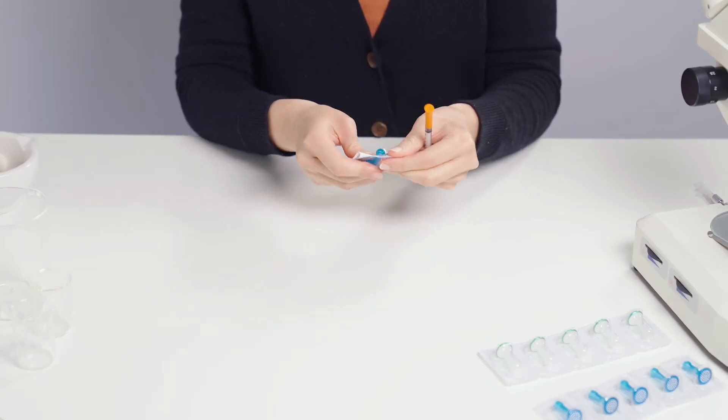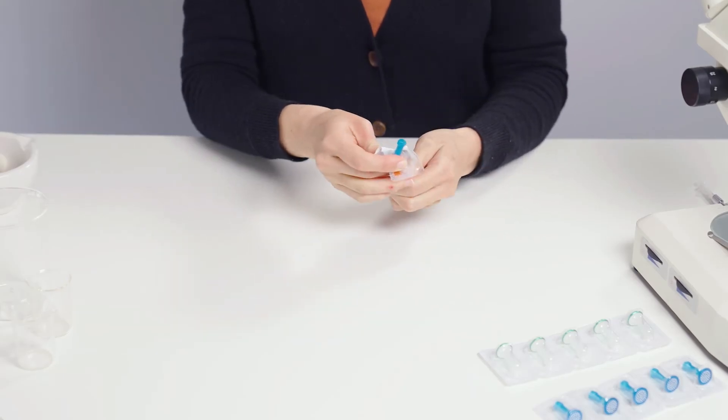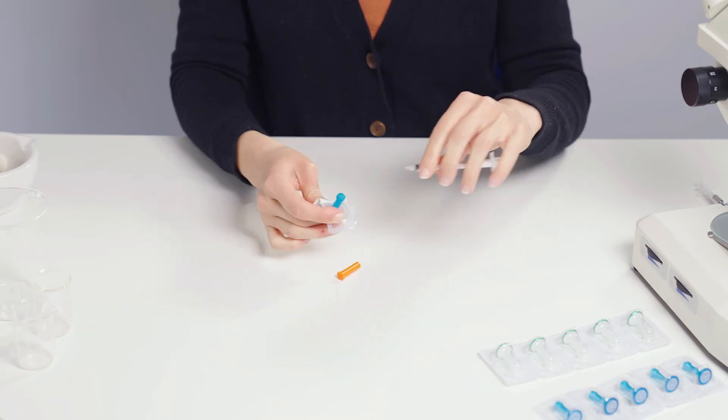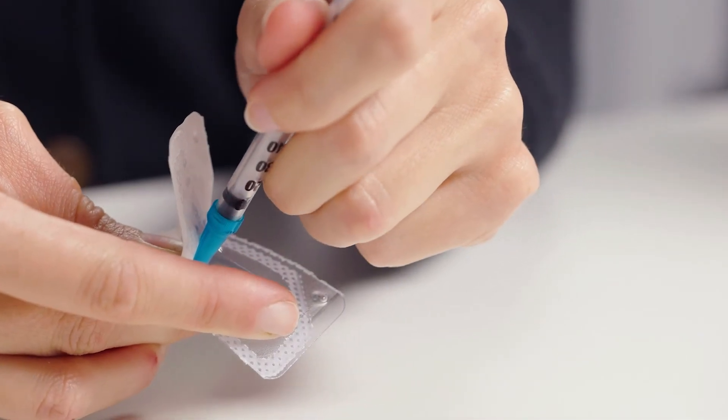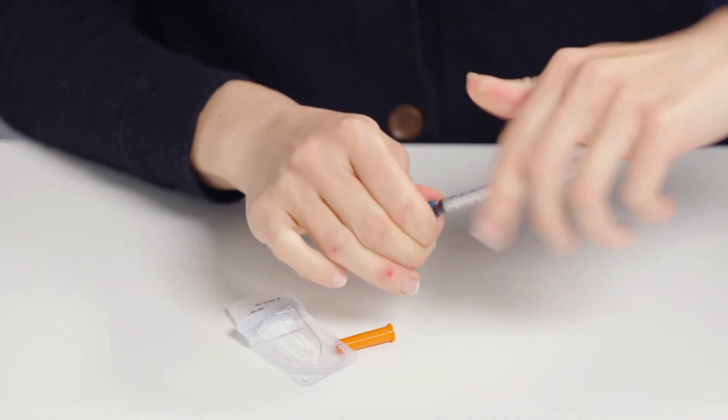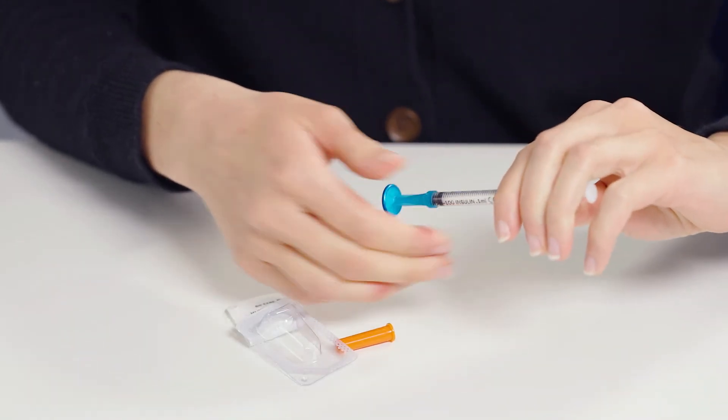Here is the same process with a BD syringe with fixed needle. Open the SteriFilt wrapping and tilt the filter upwards, again being careful not to directly touch the filter. Insert the syringe. Seal securely by screwing the syringe firmly in place.